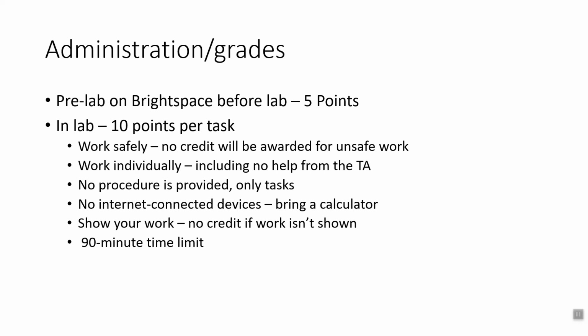It's the end of General Chemistry 2. We've told you a million times to work safely. Now's the time to prove that you can do that. Please be aware that I was at a local industrial chemistry type company recently, and there they have a zero tolerance policy. If people are not wearing their safety gear, they get fired.